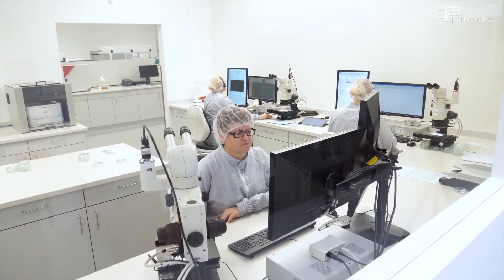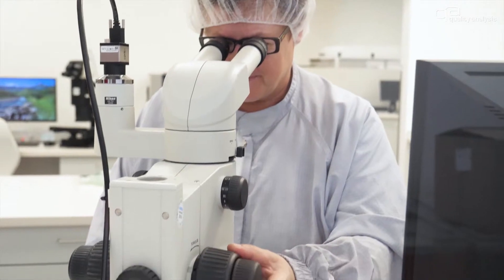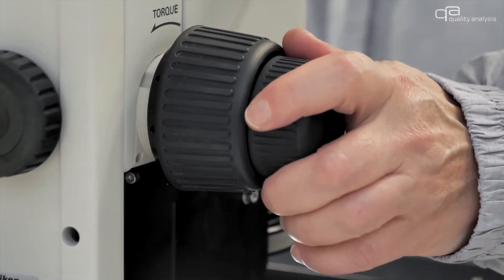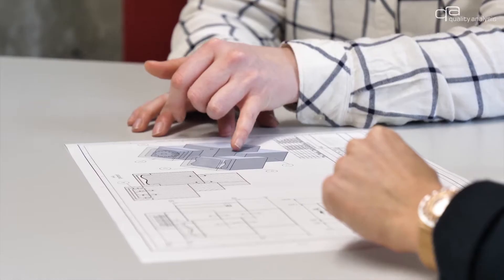We are an accredited and independent test laboratory in accordance with DIN 17025. All our processes are in compliance with the standards. In close cooperation with the respective departments we carry out the desired analysis according to your specifications.